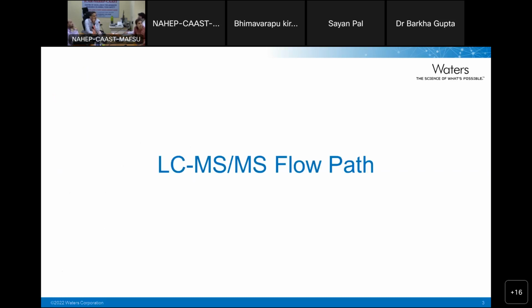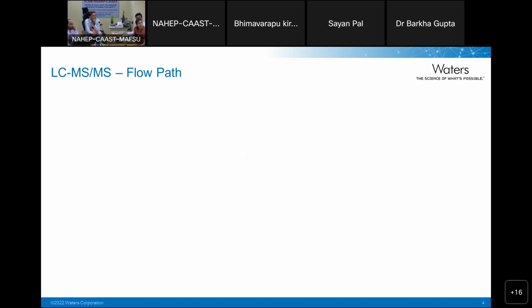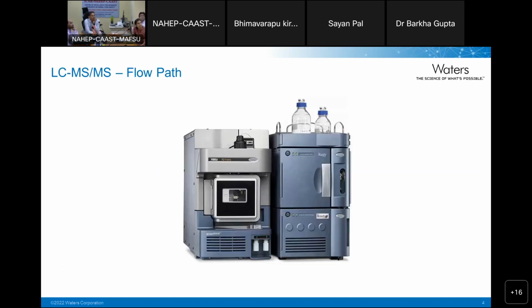So starting with the LCMS flow path, this is a typical LCMS. This is actually from Waters. You can have any other vendor, but probably they will have the same flow path.